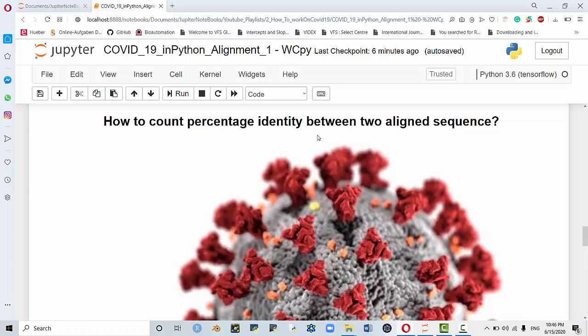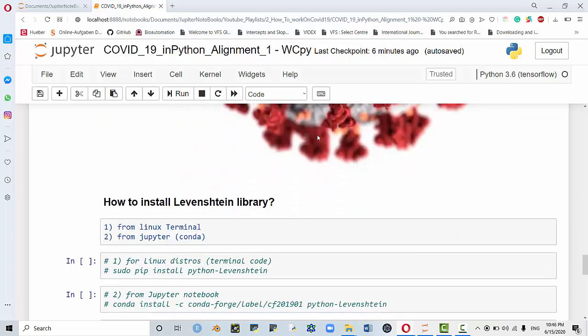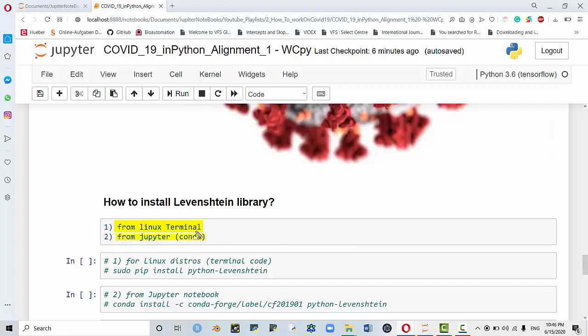Here I'm going to use a library called Levenshtein, and that Levenshtein library is quite useful. You can install the library from Linux terminal if you are using Linux, or if you are using Windows and you have Jupyter, you can use conda install. I'm going to show you both codes here.